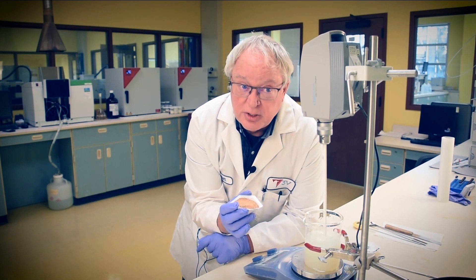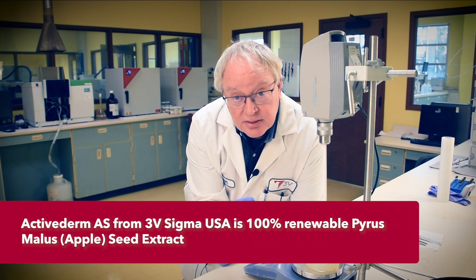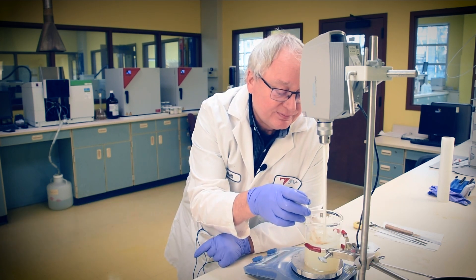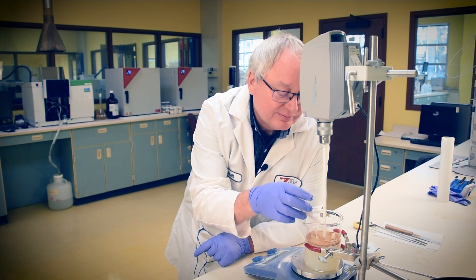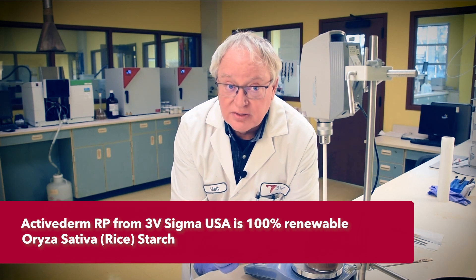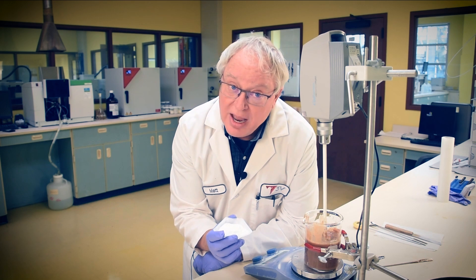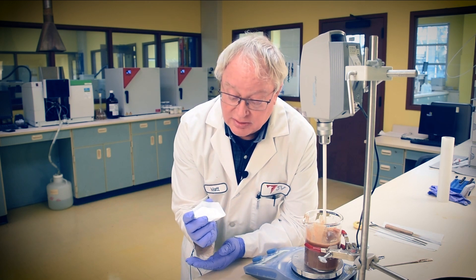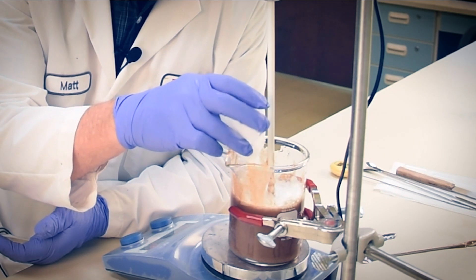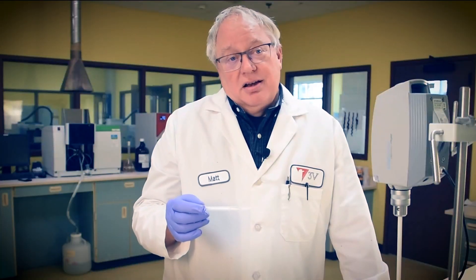With our viscosity and pH in the range we want, now it's time to add our skincare active solids. Active Derm AS is a fine ground apple seed, perfect for mild exfoliation. Active Derm RS is a fine rice starch, ideal for leaving a nice talcum-like sensation on the skin. So we use apple seed to slough away the dead skin cells, and rice starch and olive oil to soften that top layer of skin cells afterward. Renewable fruits, renewable grains — clean.